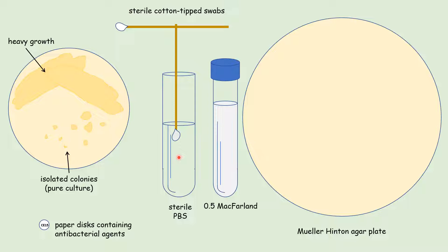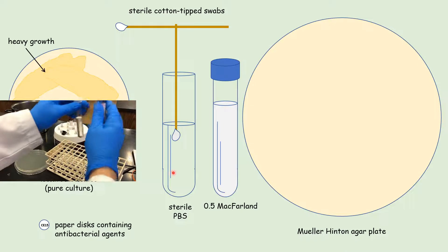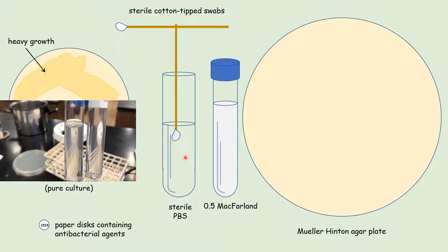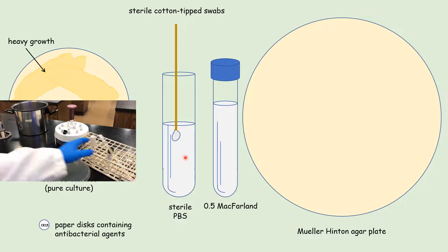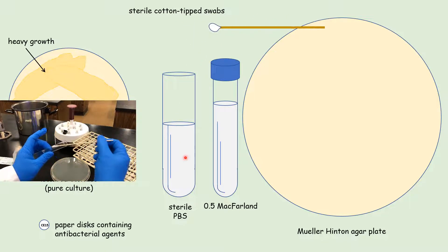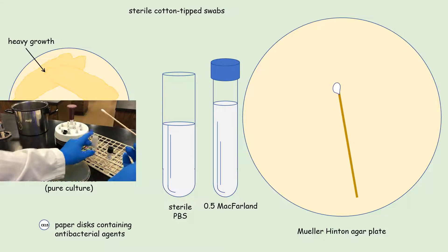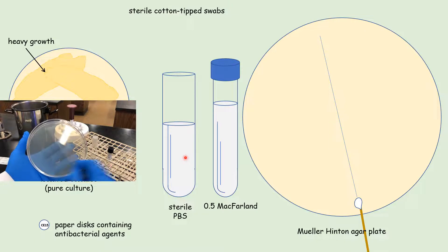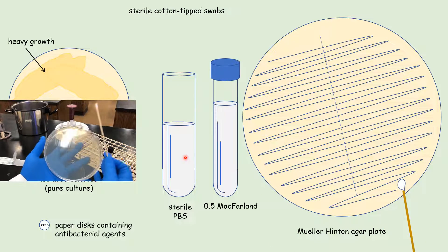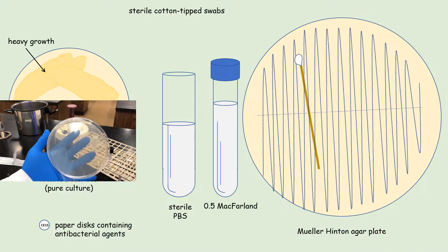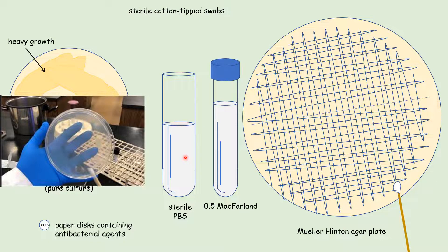This is important because if we add too much bacteria, we might overwhelm the system; if we have too little, we might not get a nice zone of inhibition. So we want approximately 1.5 times 10 to the eighth bacterial cells per mL. Then we take our second swab, dip it into the bacterial suspension, wring out the edges so it's not too wet, and streak it across the center of the Mueller-Hinton agar plate. We spread bacteria over the entire surface, rotating the plate and swabbing in opposite directions to ensure even coverage.